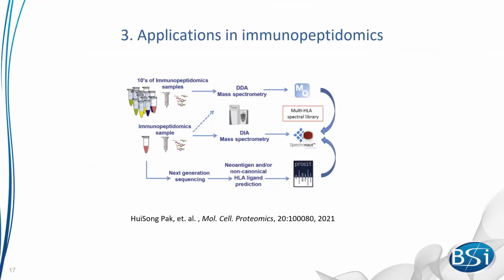This work tries to leverage different libraries from up to 20 projects to build a larger library and increase the library search sensitivity. They also use deep learning technology to improve the data analysis.